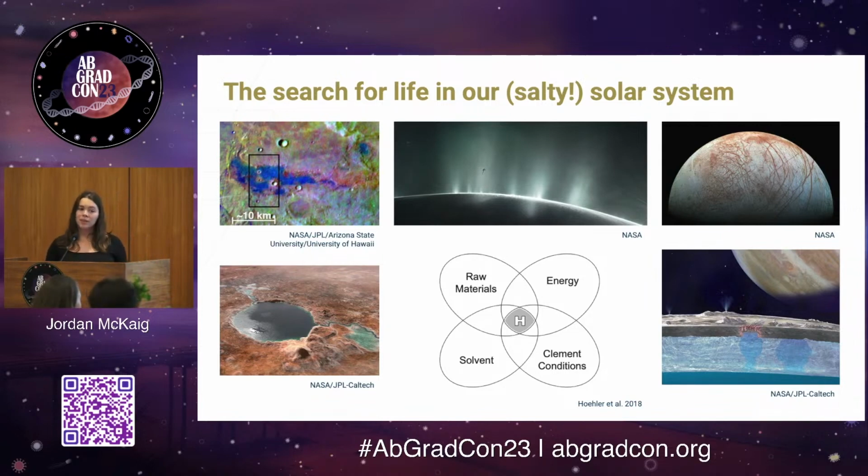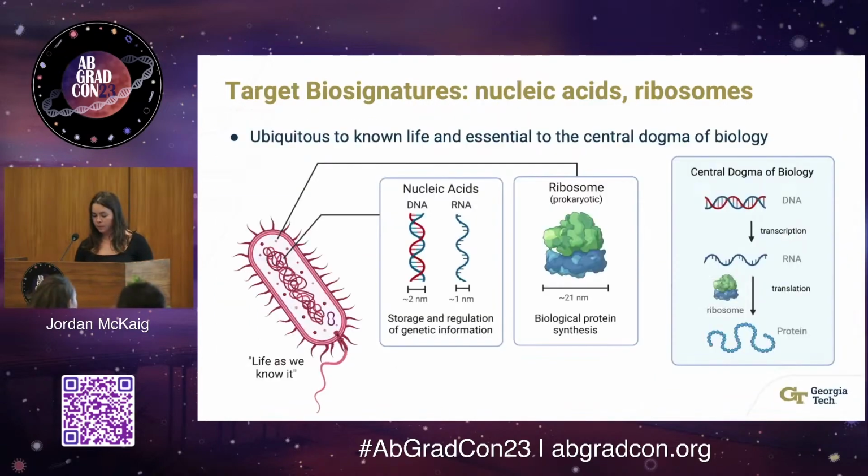Many of these environments are aqueous and saline environments. And as we've discussed previously, today and yesterday, salts have a major influence on the ability of an organism to live in an environment, as well as the potential for biosignature preservation. And I'm particularly interested in how salts can interact with these biomolecules in terms of doing detection with nanopores. So specifically the biosignatures that I'm interested in are nucleic acids and ribosomes.